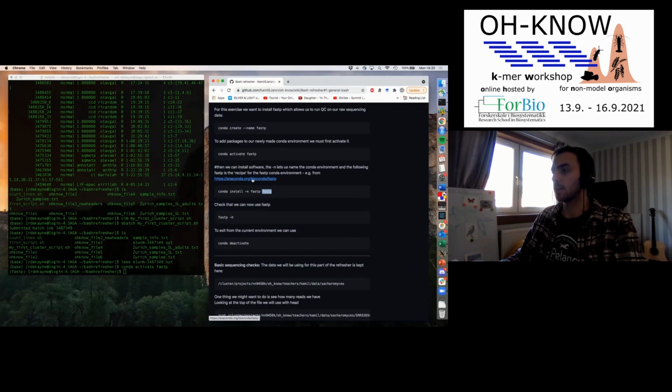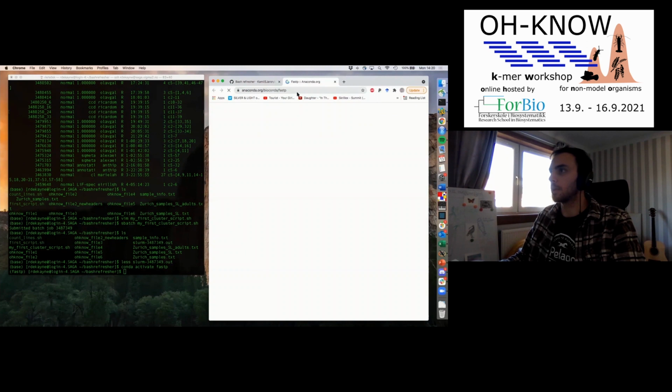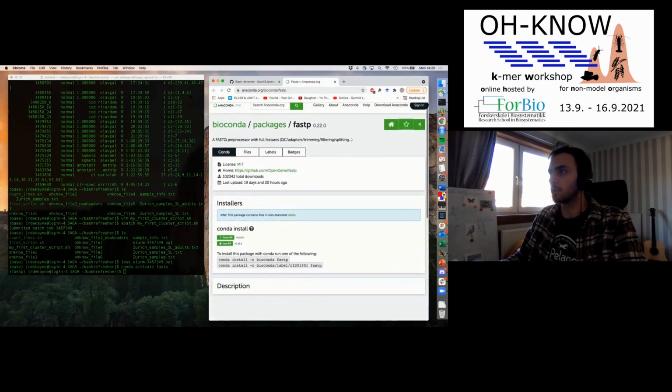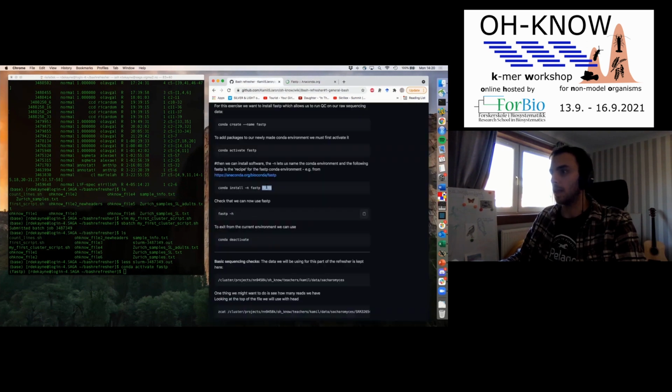If you click on this link here, I can just show you. So this is often what you'll get if you were to search Conda and a software. It will often be on anaconda.org. And you'll see here, these are two different ways of installing fastp. So they work very nicely. And you can do it like this.